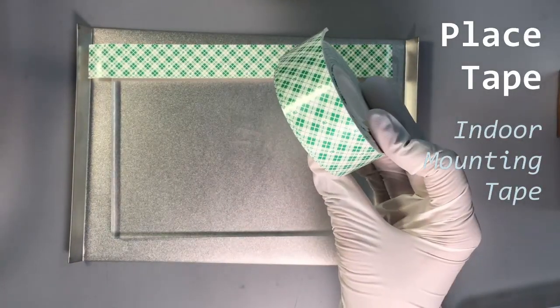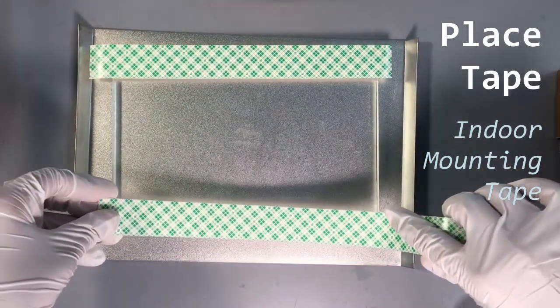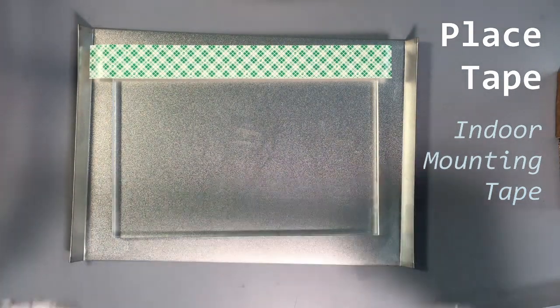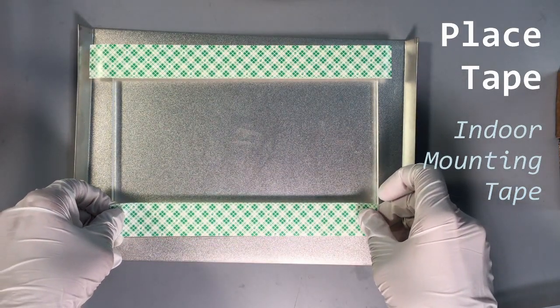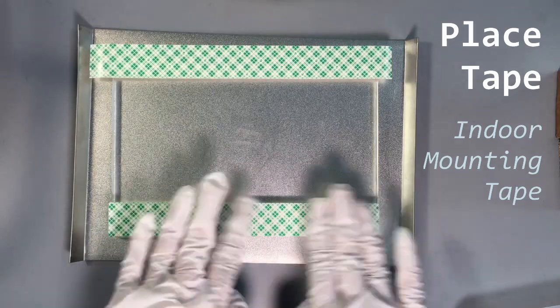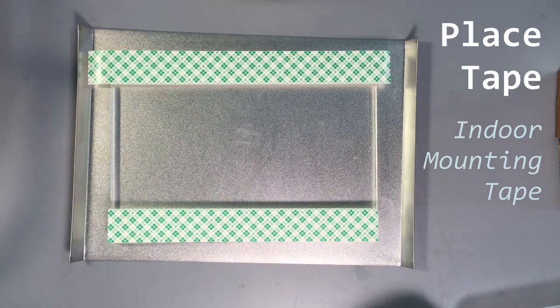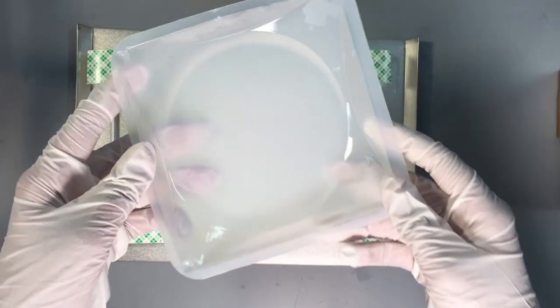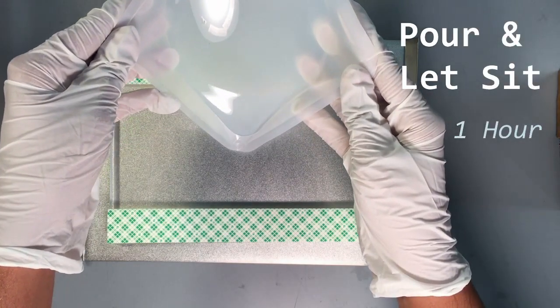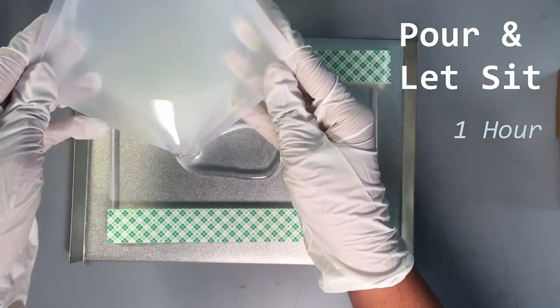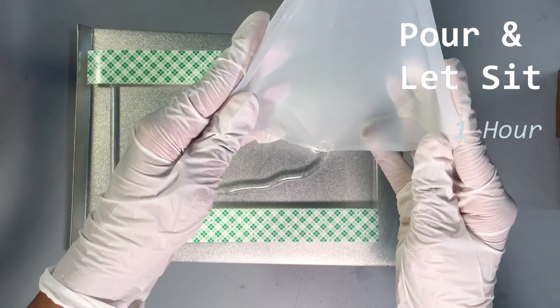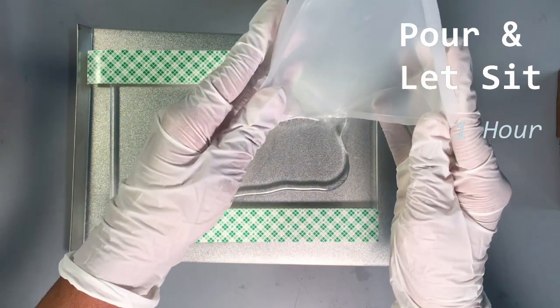Prepare your glass plate by cutting two pieces of indoor mounting tape and pasting them along the widest part of your glass plate. Ensure the plate is resting in a flat position and pour the elastomer mix onto the glass plate. If bubbles form while pouring, use a pipette tip or another sharp object to pop them.